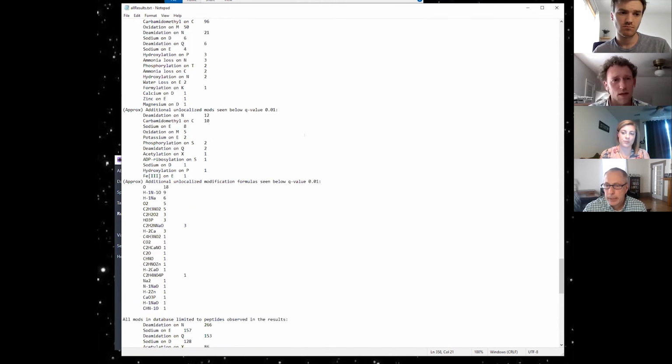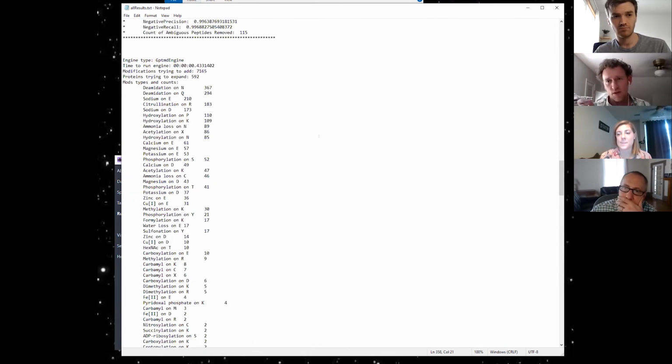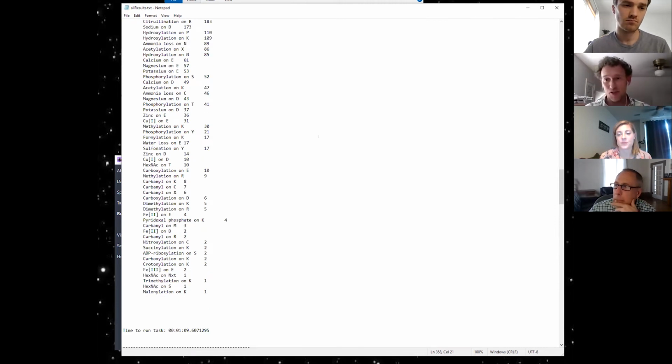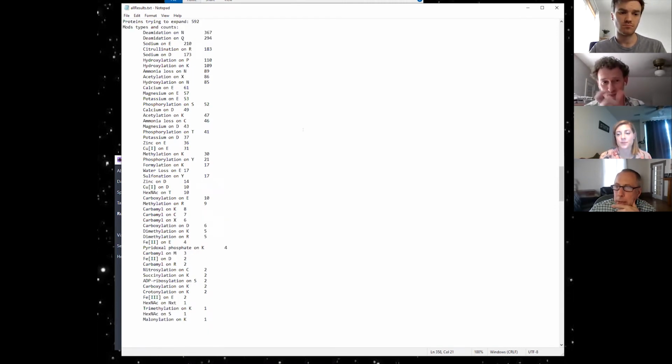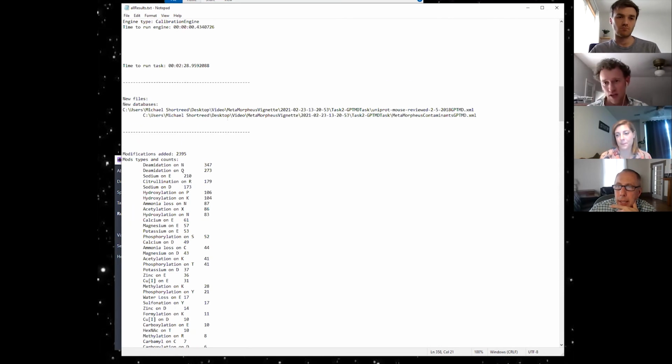Okay. So when you say they were added, you're not talking about adding these to my whole search space. You're just saying, look, at this protein right here, I think there could be a sodium adduct. Yep. Check it out. That's right.